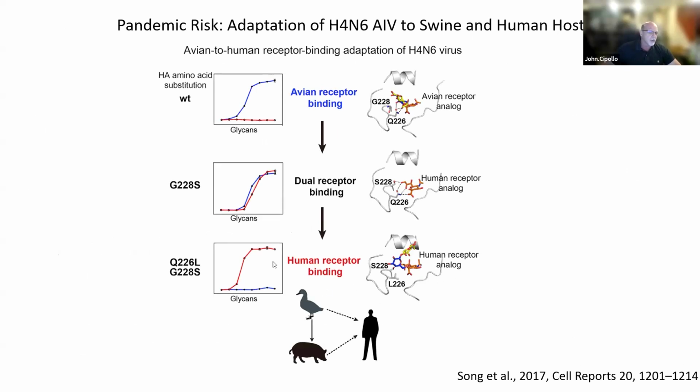So the human receptor was primarily interested in binding to 6-sialic acid, the preferred human receptor as far as we can tell. And then the dual receptor, which would bind either 2,3 or 2,6, so it could move back and forth between avian, swine, and human. And then the avian receptor, which really preferred the 2,3 sialic acid. Okay, so it has some potential there if it does jump, and it seems to be liking the idea. What happens if it jumps?